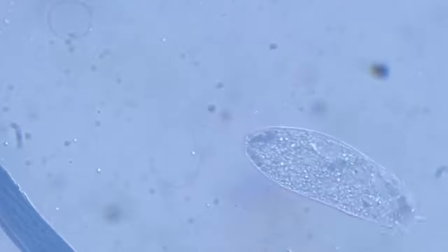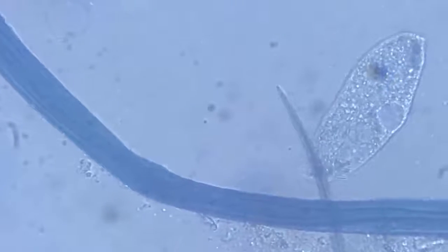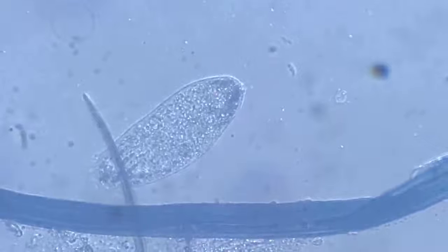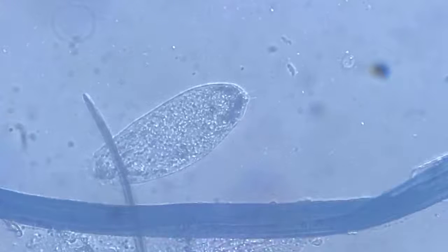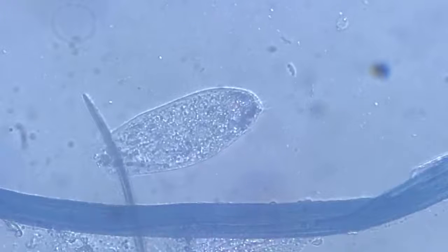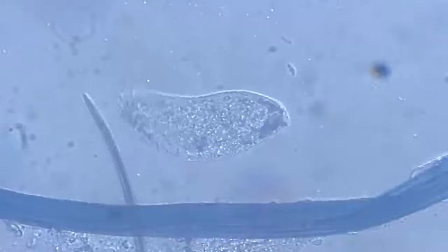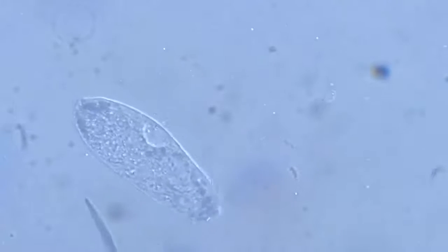From the very slowed down movement of this animal, I presume that the environment has become extremely harsh for him, so much so that he is finding it difficult to negotiate. The water film is so precariously thin that he is unable to take a good swim. These are very swift swimmers, otherwise.